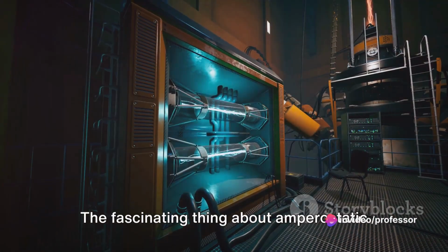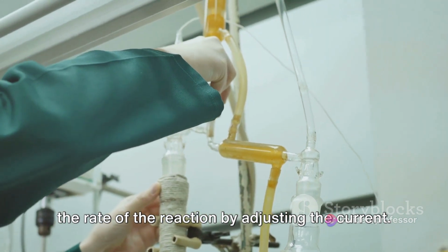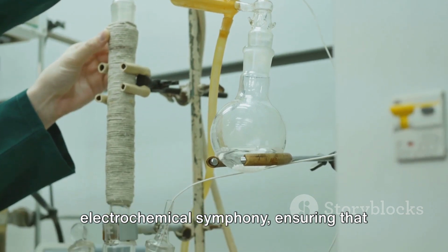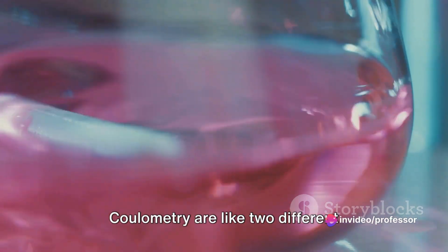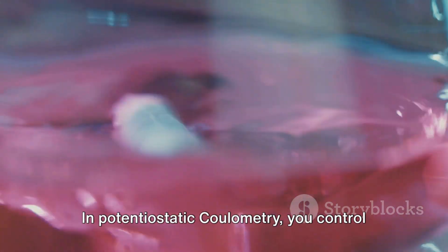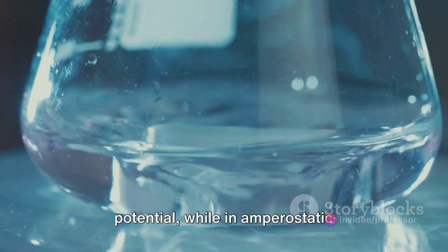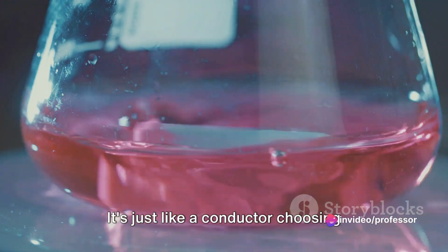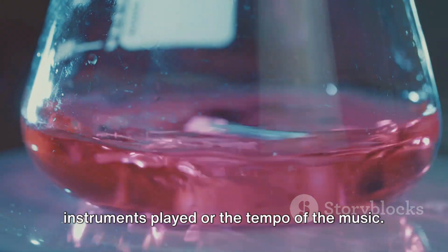The fascinating thing about amperostatic coulometry is that it allows us to control the rate of the reaction by adjusting the current. It's like setting the tempo for our electrochemical symphony, ensuring that the performance proceeds at a steady pace. So, you see, these two types of coulometry are like two different strategies to conduct the same electrochemical performance. In potentiostatic coulometry, you control the types of reactions by adjusting the potential, while in amperostatic coulometry, you control the rate of reactions by adjusting the current. It's just like a conductor choosing whether to control the types of instruments played or the tempo of the music.